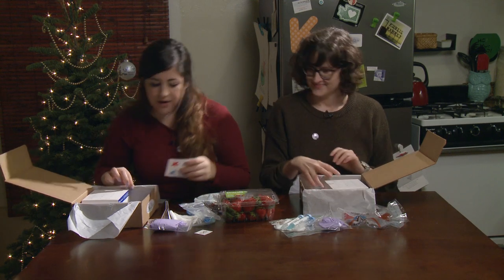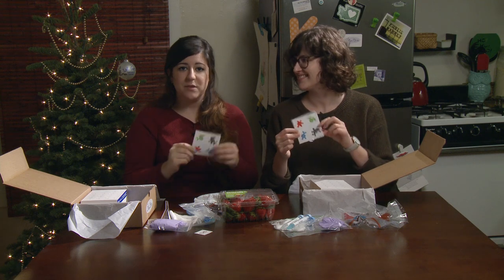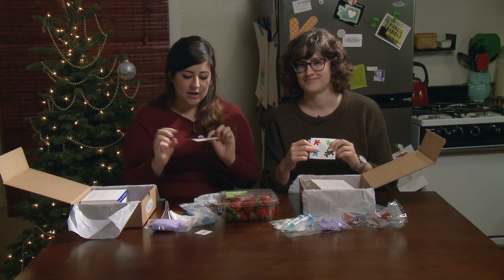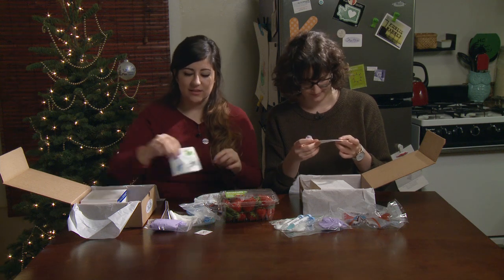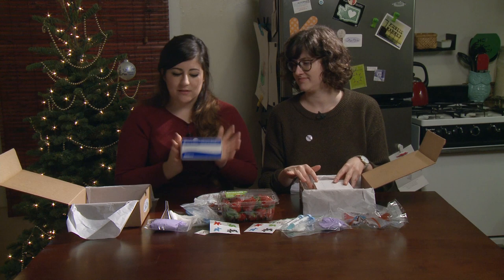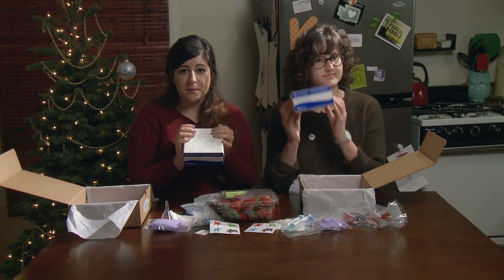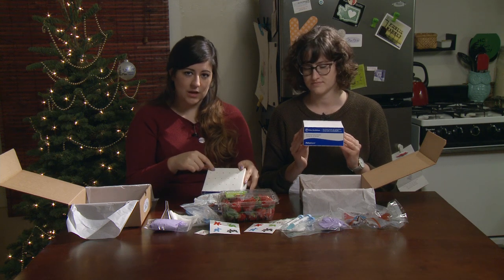Two more things. Base pair stickers — these are the base pairs of DNA. You have thymine, guanine, adenine, and cytosine. Those are for fun for later. And lastly, the biggest piece of the box — this is your tube rack. These are disposable but you can reuse them. To use them, you just poke a hole in the top.